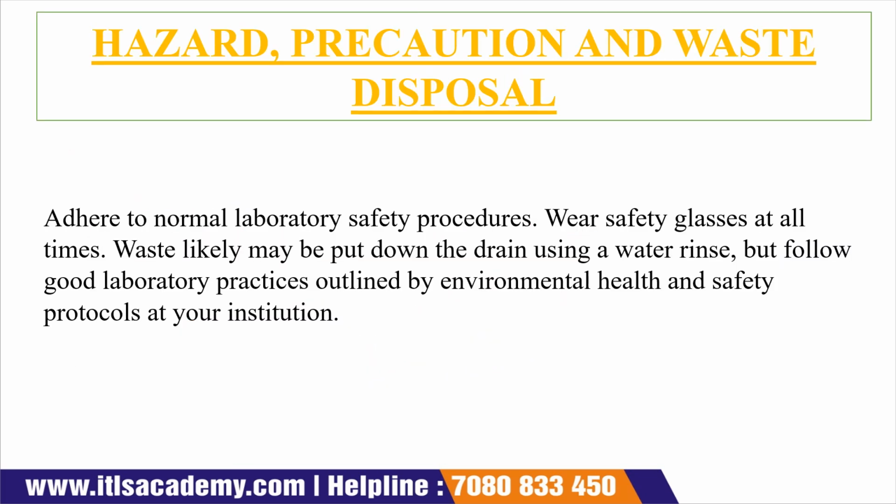Now the next one is hazard precaution and waste disposal. We all know that when we are handling chemicals, we have to take care. So we have to follow normal laboratory procedure. We have to wear gloves, glasses, proper shoes and a lab coat, and the waste which comes out of this experiment should be discarded in a separate bin, and maybe it should be drained with the help of water.